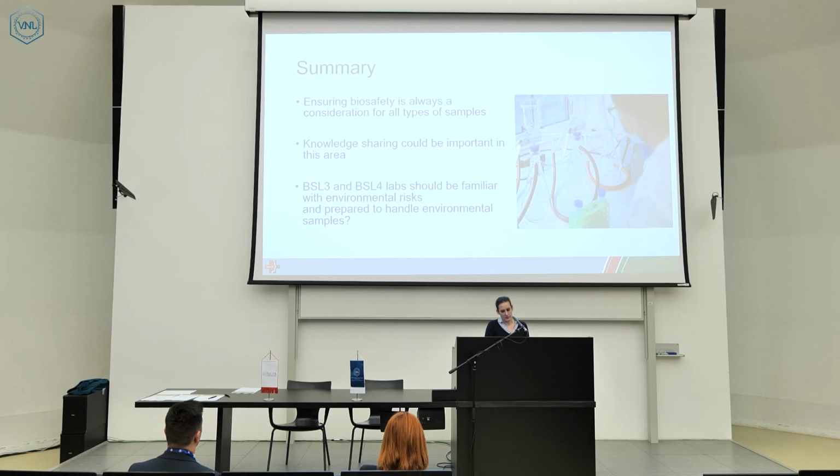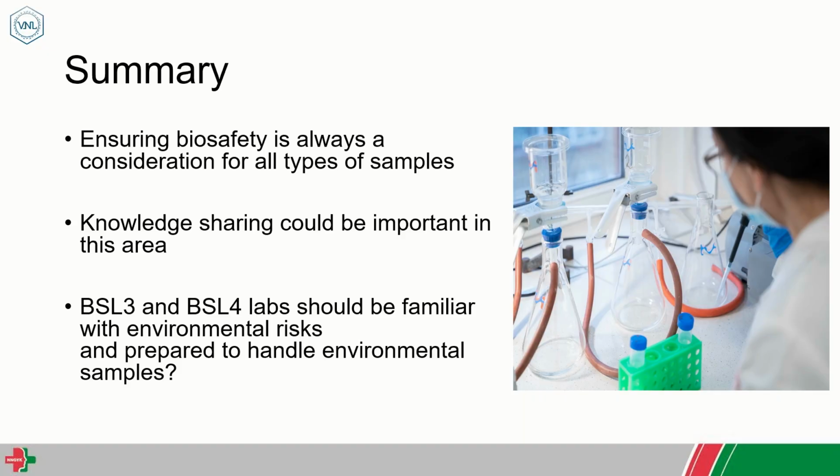And maybe, however it's not very typical or not very often, we should think about how to handle these high risk level environmental samples, and whether high biosafety laboratories have to be prepared for these samples or not.